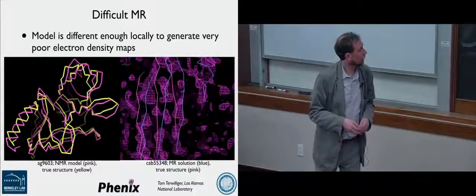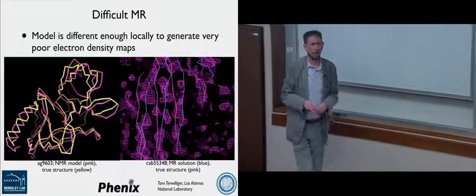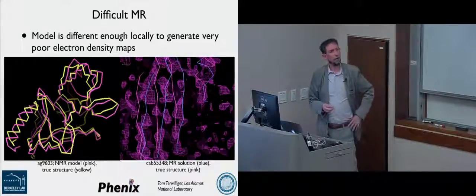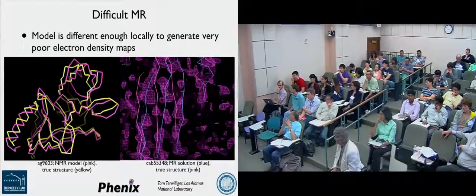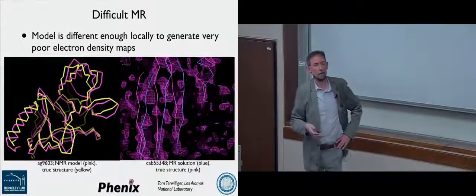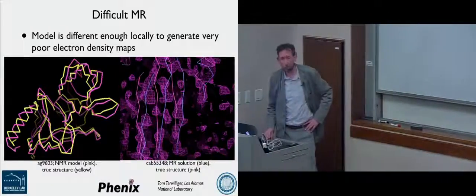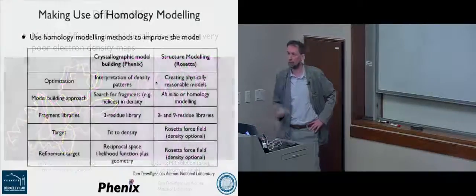I'm going to guess those 60+%, maybe. I don't know. These are pretty different. The one on the left, I just have a correlation coefficient. Yeah. So if you take the two maps at, I forget, about 2 angstrom resolution, you just do correlation, it's about 0.15. Yeah, so often the correlations are what, in the 20% sort of area. Phase error, I'm going to guess that's going to be a pretty high phase error to give you a map that's bad. But essentially very difficult for a human being to try and interpret that thing on the right. If you can, we'd love to talk to you. Tell us something.